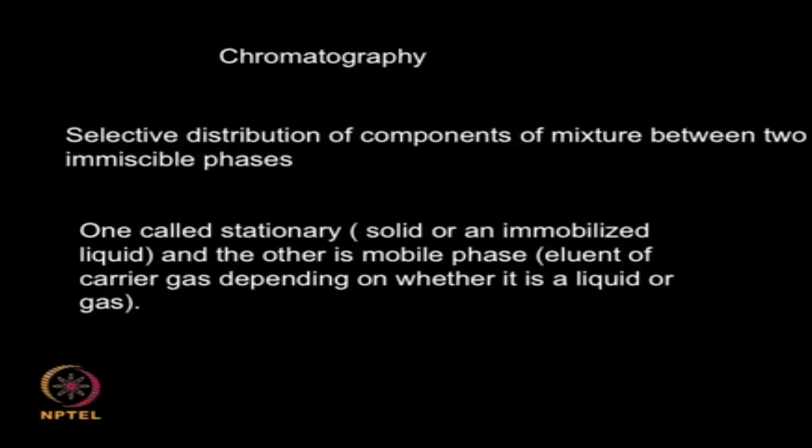So what does it do? Basically a solute gets distributed in the continuous phase as well as in the stationary phase. That is what happens actually. So this distribution happens because of so many factors, either it is partition, whether it is because of ionic forces, whether it is because of hydrophobic forces, or certain types of ligands selectively bind certain proteins.